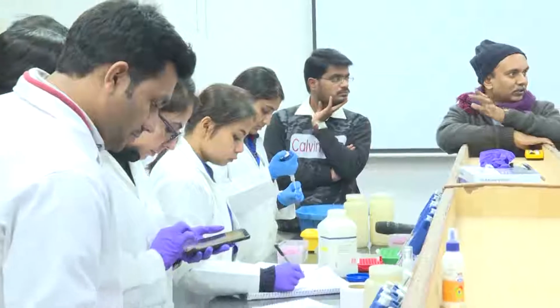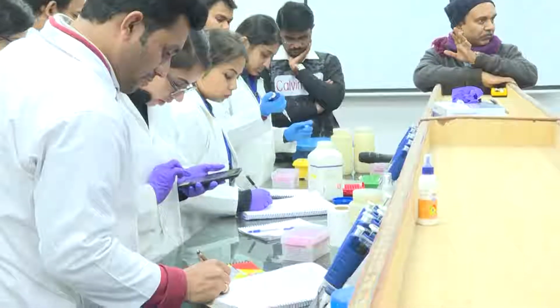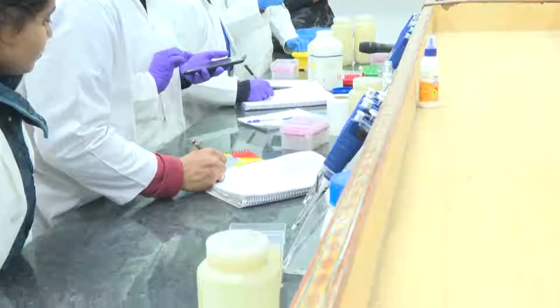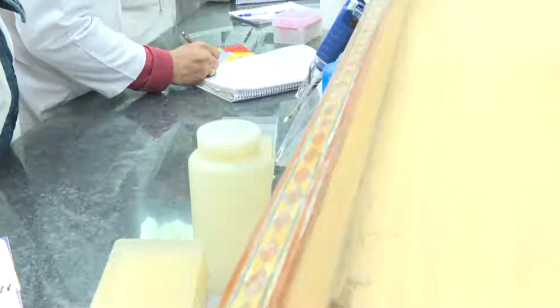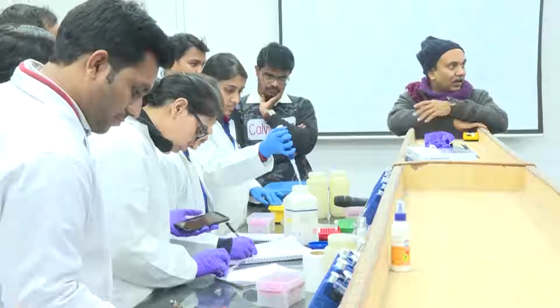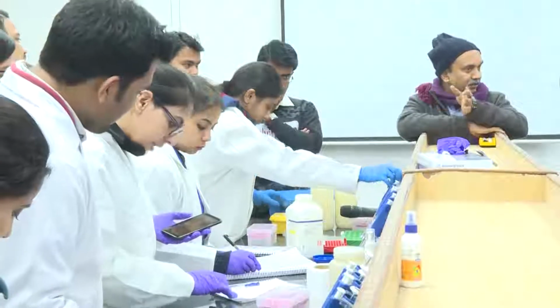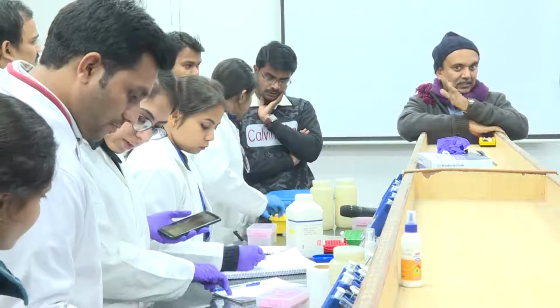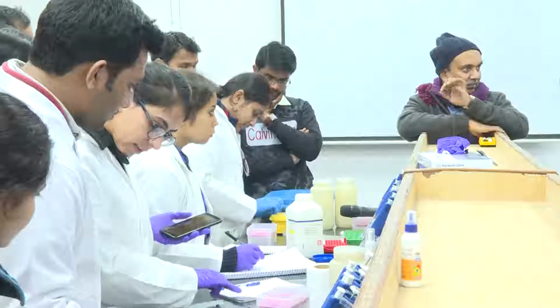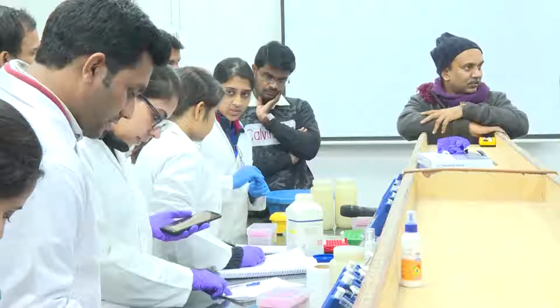I wish we do this whole preparation in a cabinet which is free from contamination. Always do it. Either you can buy a PCR cabinet, which will cost about 1.2 to 2 lakh rupees, or you make one by yourself. You can take Perspex glass and plate, make a cabinet, put a UV lamp in, and try to keep the area clean.